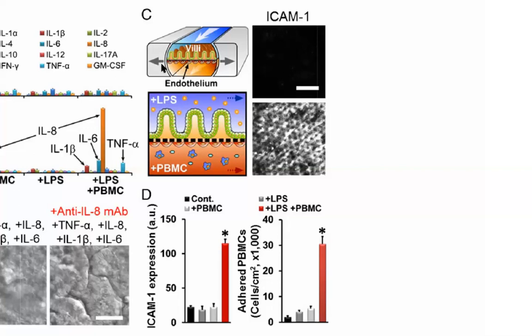And they tested ICAM-1, meaning intercellular adhesion molecule 1. It is known to bind leukocytes, or immune cells, when stimulated by cytokines. So we can see when they add this LPS and then PBMC, we actually can see this ICAM-1 expressed very highly.